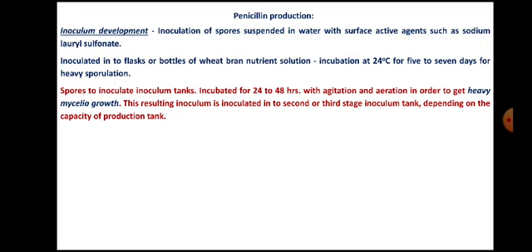And then the resulting mycelial inoculum is inoculated into a second or third stage of inoculum tank, depending on the capacity of the production tank.